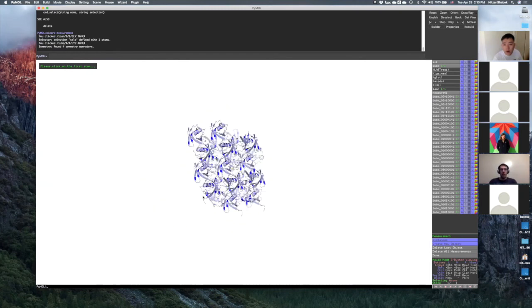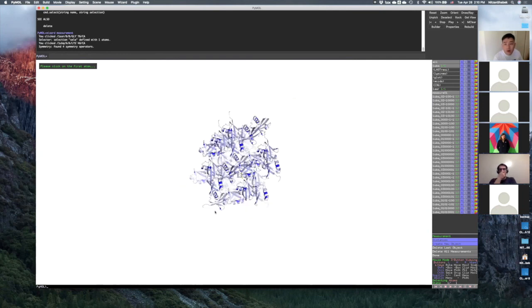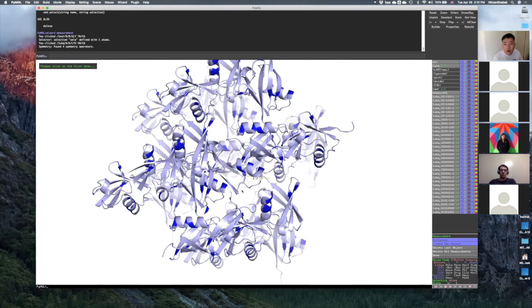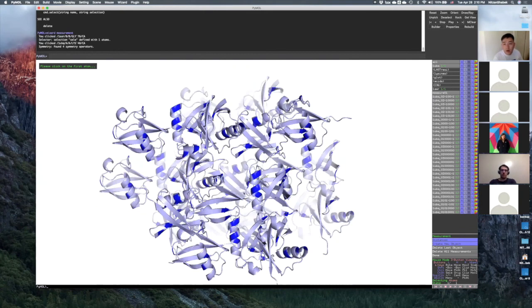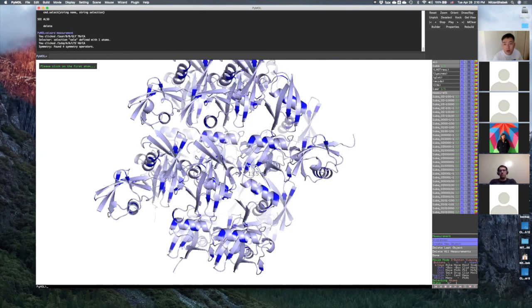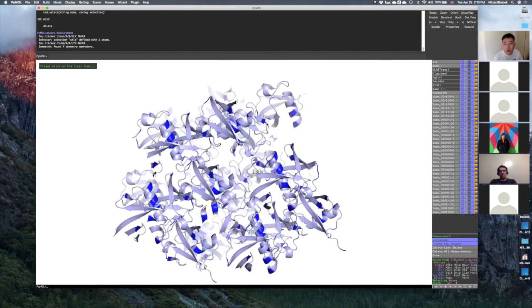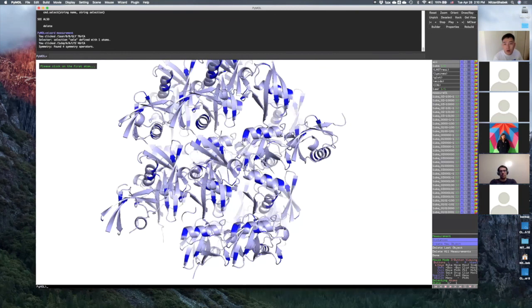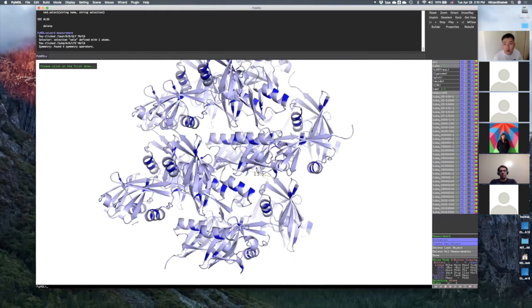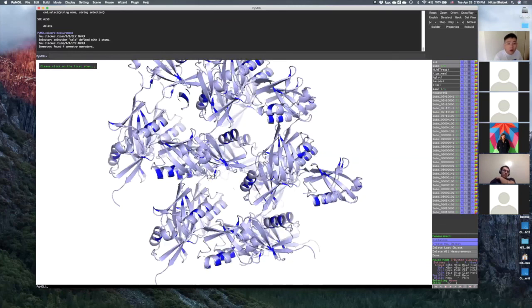So you can understand that we only look at one copy that represents all the copies, but it's all symmetry. So these are all things that we can do. And sometimes it's important for some structures to understand how they crystallize, and whether the packing between the crystals, between the proteins, may interrupt or change some of the loops that might seem different. So we always want to try to see this part. So that's just different ways that we can look at structure.